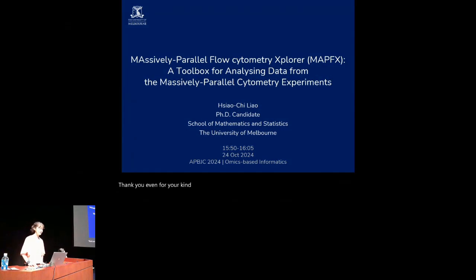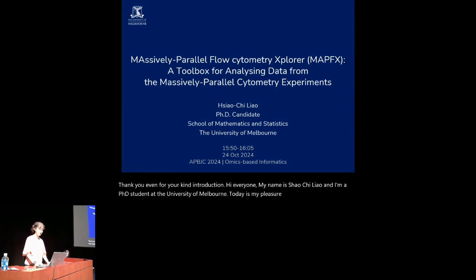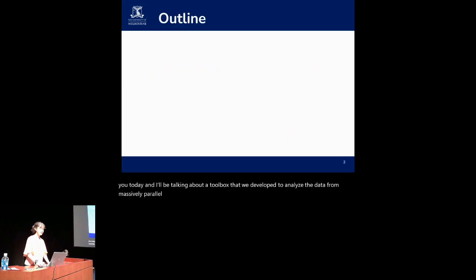Hi, everyone. My name is Hsiao-Chi Liao, and I'm a PhD student at the University of Melbourne. It is my pleasure to share our research with you today, and I'll be talking about a toolbox that we developed to analyze the data from massively parallel cytometry experiments.